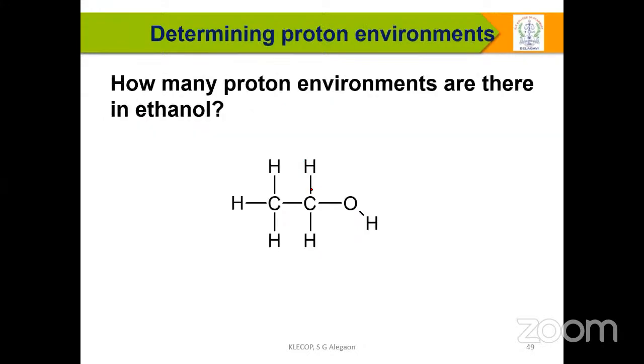Now, I am a little optimistic that you understand a little about how exactly NMR works. You should concentrate more on structural elucidation. If anyone brings an IR spectrum or NMR spectrum, you should be able to interpret it, rather than only knowing how NMR or IR works.